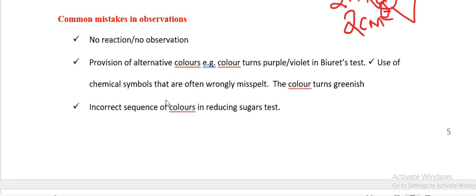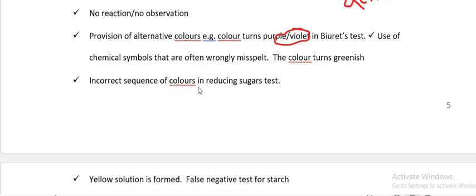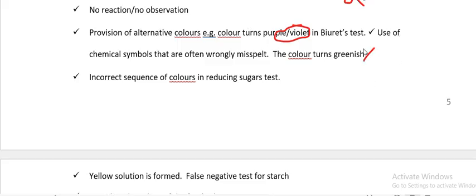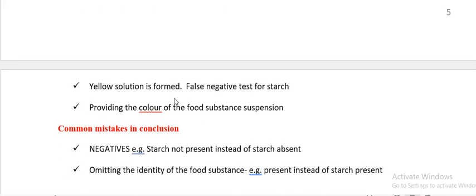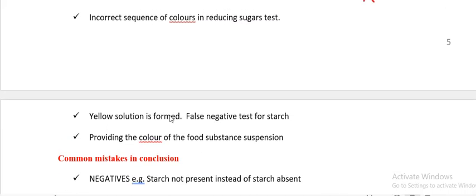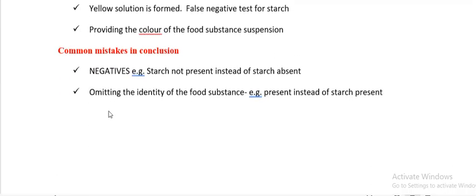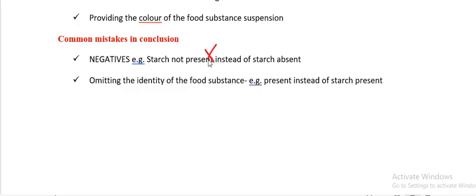Common mistakes in observation: stating 'no observation' or 'no reaction' — these are wrong. Providing alternative colours, e.g., 'purple/violet' in the Biuret test, is wrong — write only one colour. Writing 'greenish' is wrong; it should be 'green.' In conclusions, negatives like 'starch not present' are wrong — say 'starch absent.' Omitting the identity of the food substance, e.g., writing 'present' instead of 'starch present,' will cost marks — always include the food substance.